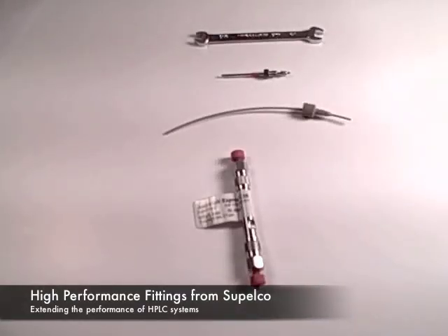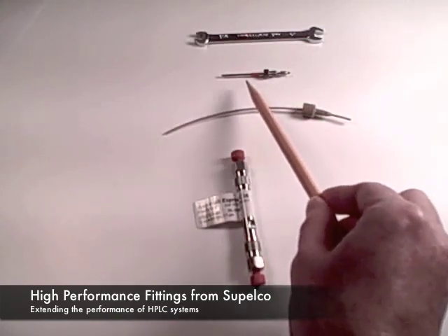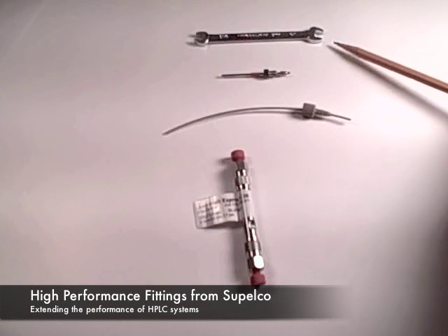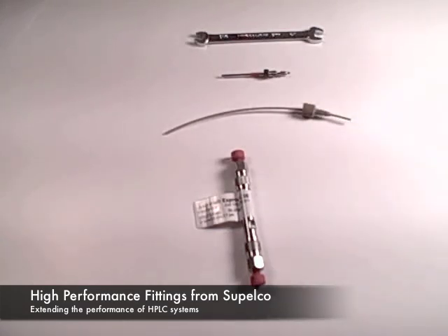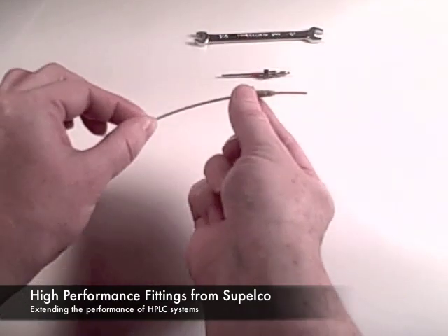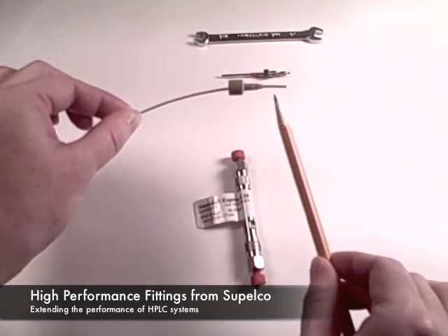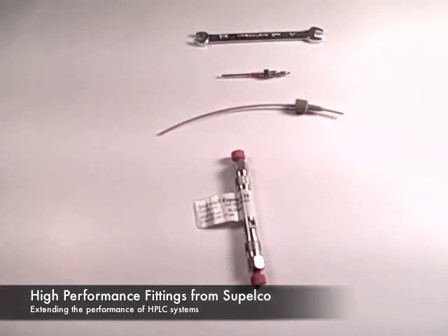Fast HPLC is pushing HPLC systems toward their pressure limit by increasing flow rates or reducing media particle size. PEEK tubing and fittings have largely replaced stainless steel tubing, since stainless steel assemblies require tools to tighten nuts and ferrules. The difficulty with PEEK at higher pressures, or even through repeated use at lower pressures, are slippage, stretch, and deformation of the tip of the tubing. All of these translate into decreased performance resulting in poor peak shape through additional system void.